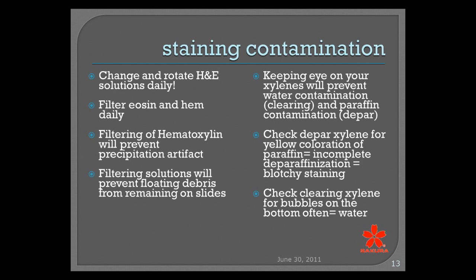Filtering your solutions is also going to prevent debris from remaining on your slides that may be floating in your solutions. Keep an eye on your xylenes. Your xylenes, and we're talking about clearing and deparaffinization. If your deparaffinization xylene is starting to turn a yellowish color, then your xylene is becoming contaminated or saturated with paraffin. Once it becomes saturated with paraffin, then you can experience incomplete deparaffinization, and you're going to wind up with a blotchy stain.